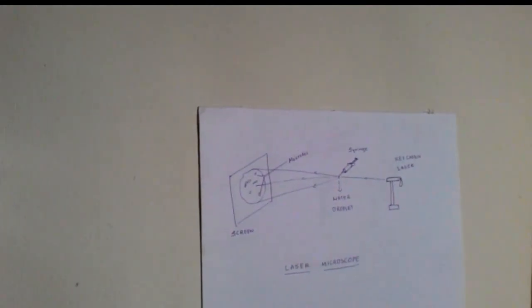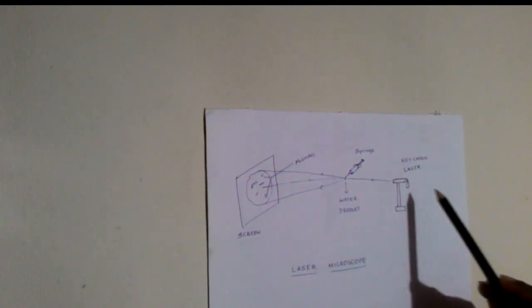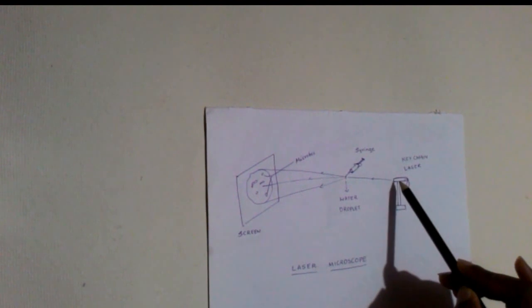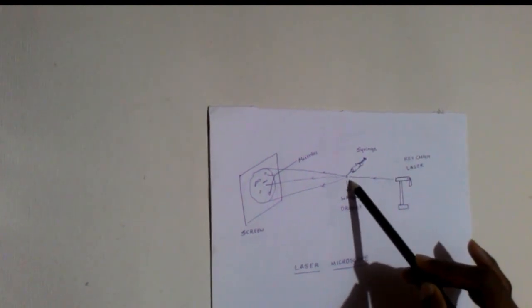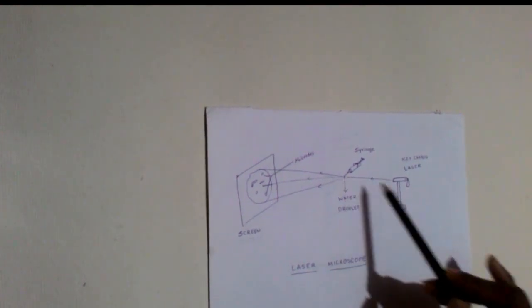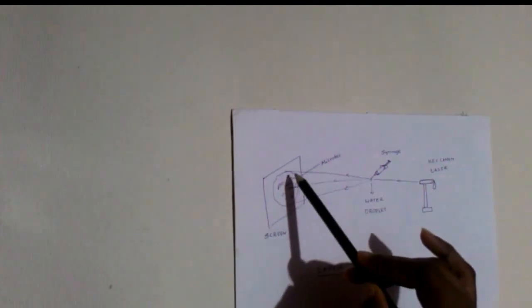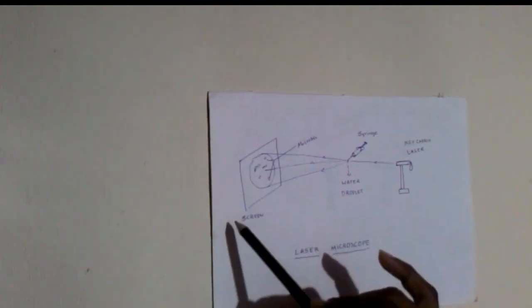So let's see how this system is going to work. We will be going to have the laser light like this and a syringe. The syringe droplet will be like this. The laser passes through the droplet and this water droplet will act as a lens, so it will be projected to the chart paper.